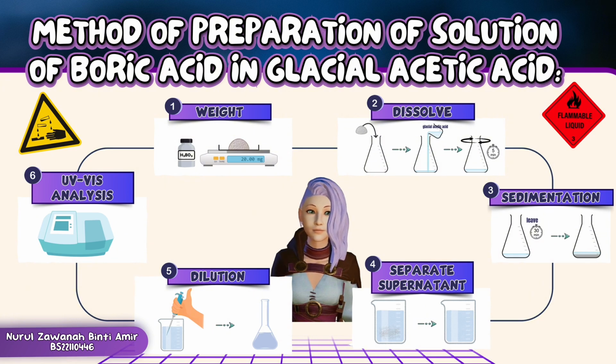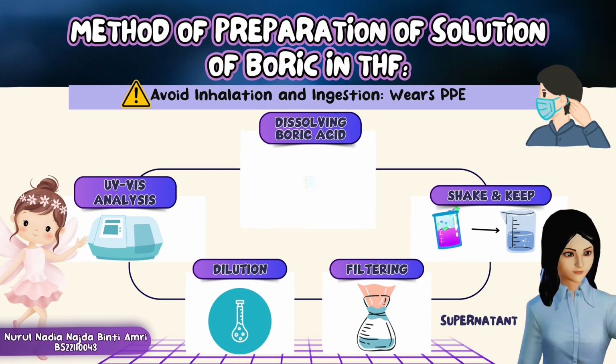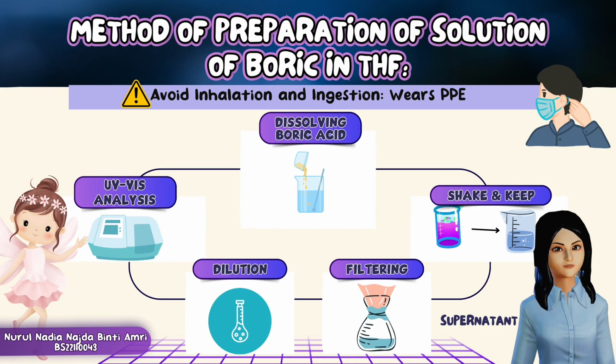From the table, it was observed that methanol and ethanol give the highest percentage due to differences in molecular interactions between boric acid and the solvent's molecules. As we know, boric acid is a weak Lewis acid and fairly soluble in water because protons are not produced, and lastly due to the high temperature. Solubility of boric acid increases as energy overcomes the intermolecular forces.